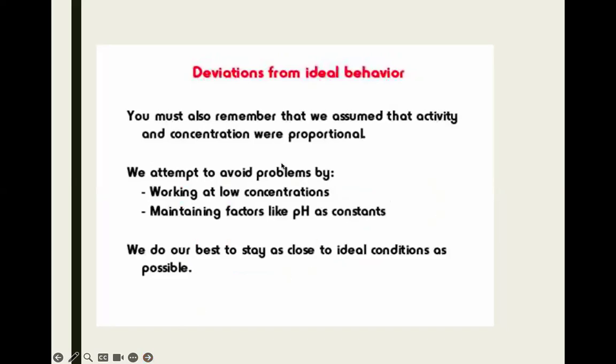So these are some suggestions to avoid those problems: you work at low concentrations, maintaining factors. We study the pH first, and you at least take some precautions.